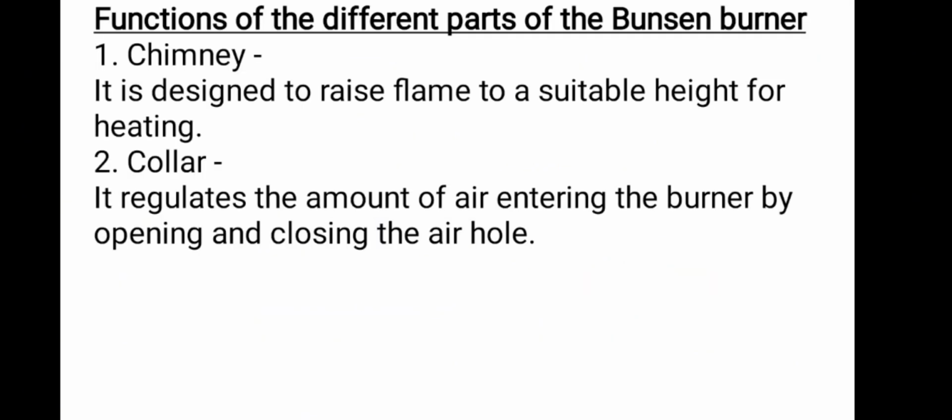And then we look at the second, which is the collar, and we say the collar is the part of the Bunsen burner that regulates the amount of air entering the Bunsen burner by opening and closing the air hole.